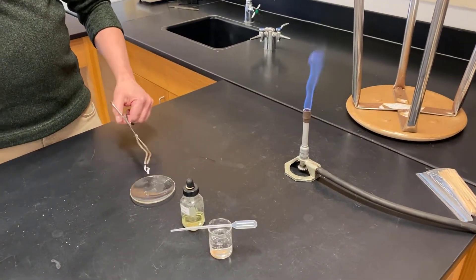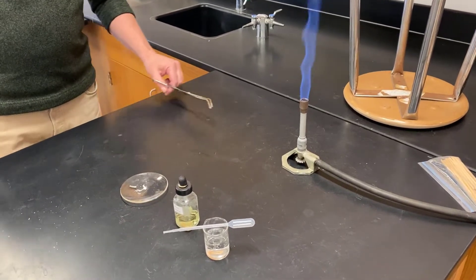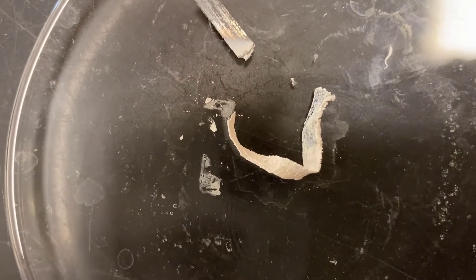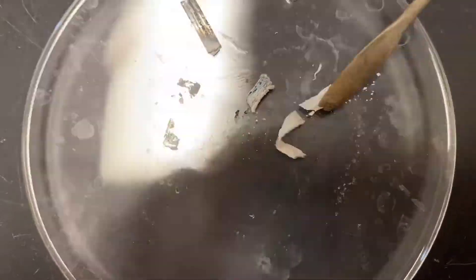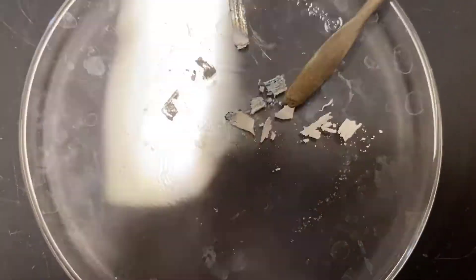Once the magnesium has finished burning in air with the oxygen, we'll gently place it in the glass. Here is our magnesium oxide, and as you can see, it's changed colors — it's kind of a whitish color. If you look at it, it's kind of brittle, very easily breakable. It's changed into our new substance.